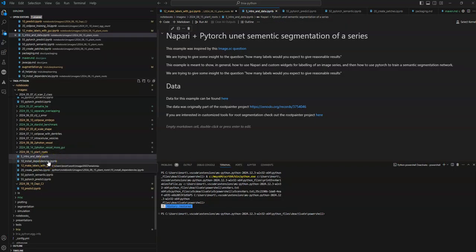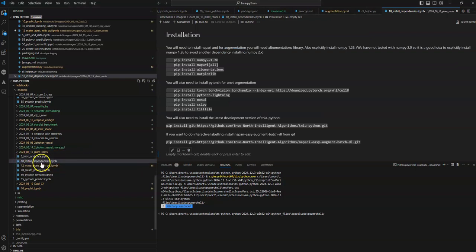Okay, so if you end up getting this code, you'll see, again, organized into sections. This second one is called 10, and it has the dependencies you need to install to get this working. And just sometimes people are confused, well, why is it named 5, 10, and so on? Why not start with 1? That's done a lot of times because if you have a collection of these and you ever realize, oh, I need an extra one between 5 and 10, it leaves room to add things you forgot about. So this is a common numbering scheme where you skip a lot.